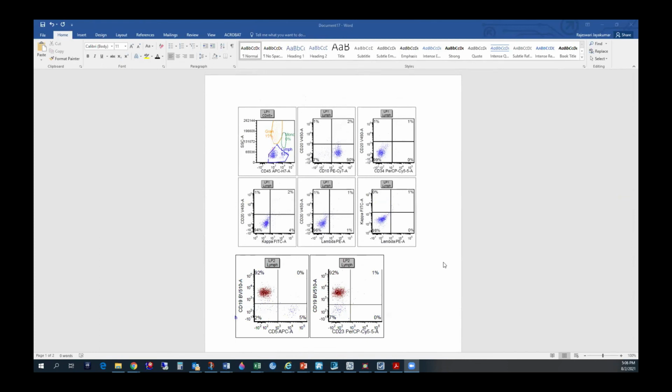Yeah, and we and the clinicians both thought that because it is a very localized PET positive lesion, it was not in the entire marrow. The marrow was biopsied before and was negative. So it was very unusual for B-ALL to present so localized like that. So clinically, and even we thought it could be just relapse, but this one threw us off. So just wanted to show you guys.